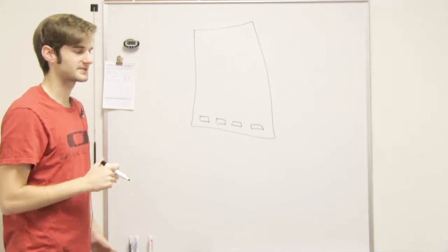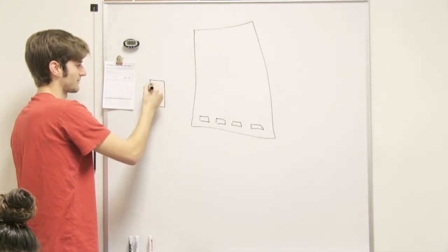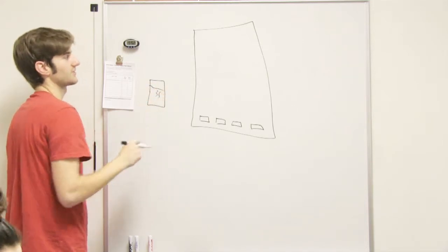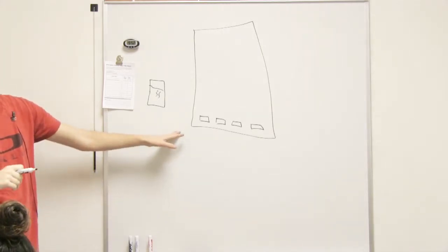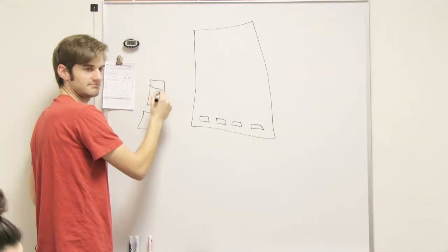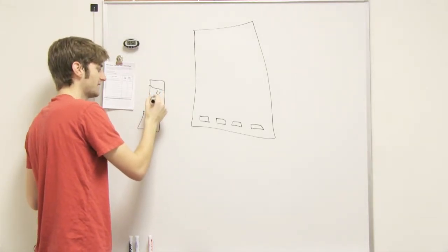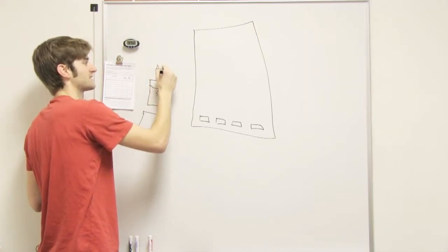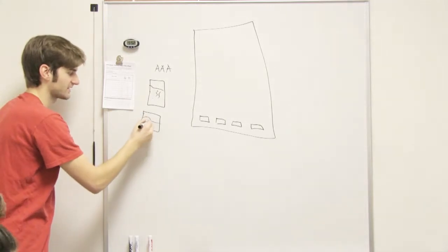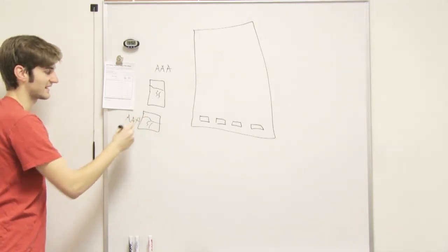And so what happens is you take DNA from something and put it into a mixture with restriction enzymes. So let's say we're doing a crime scene. We find blood at the crime scene, and we take DNA from it and cut it with a restriction enzyme that cuts every time it sees AAA. Then we have 3 different suspects. We put their DNA in the same thing, but we use the exact same restriction enzyme.